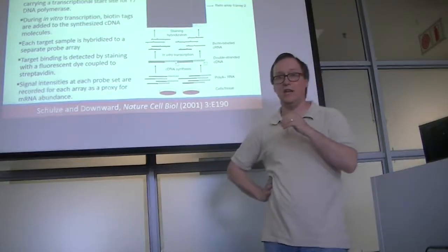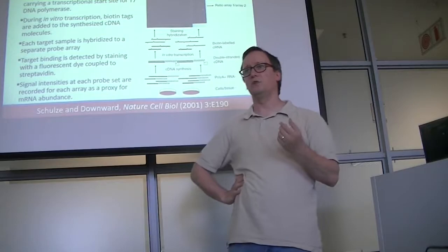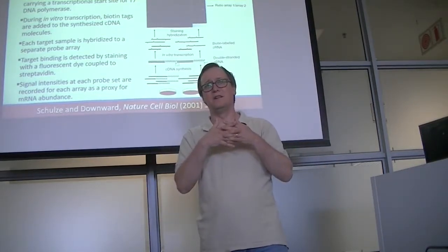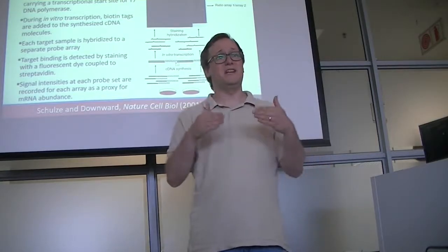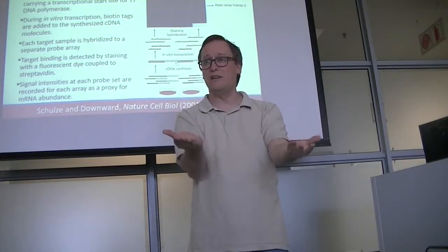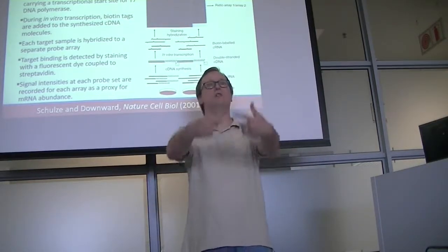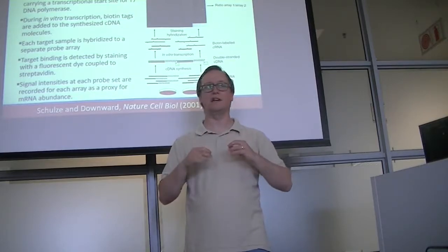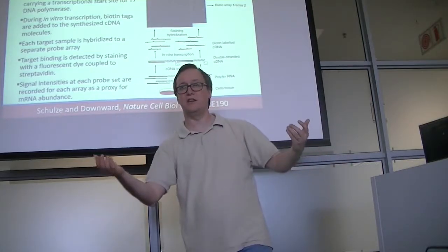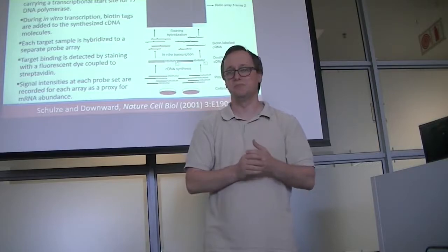Okay, now, in the old days, you would frequently see pictures of microarrays in which you saw green dots and red dots and yellow dots. The reason you would see yellow dots is that in projected light, red light plus green light is yellow light. So when we saw a yellow color on these microarrays, it reflected the fact that both samples, the red labeled one and the green labeled one, were both emitting light at this particular probe sequence.